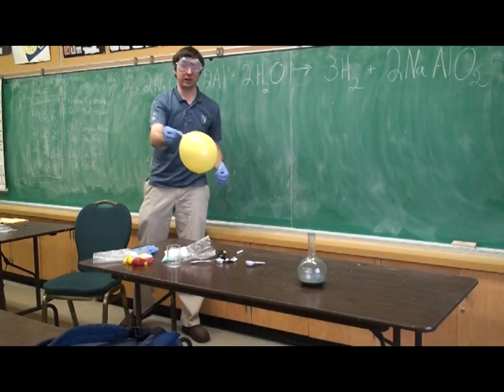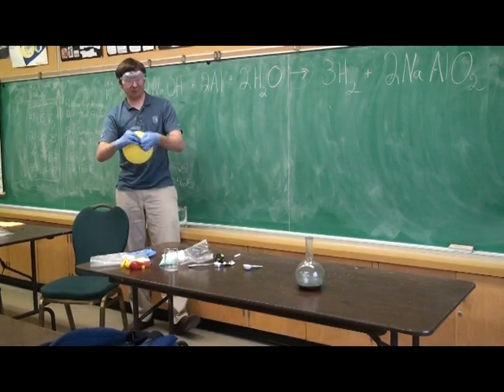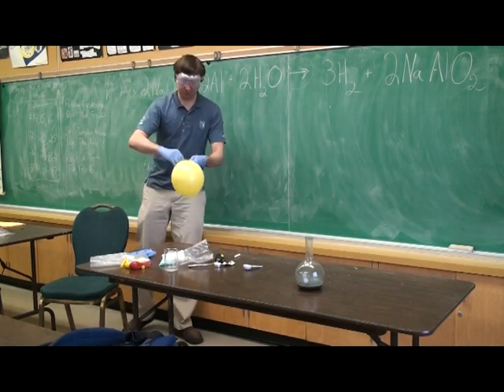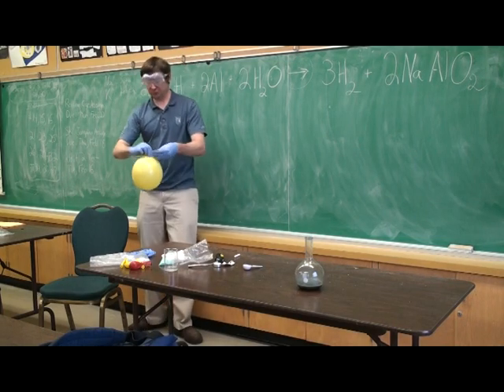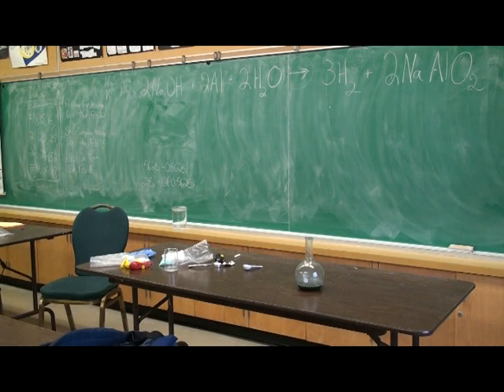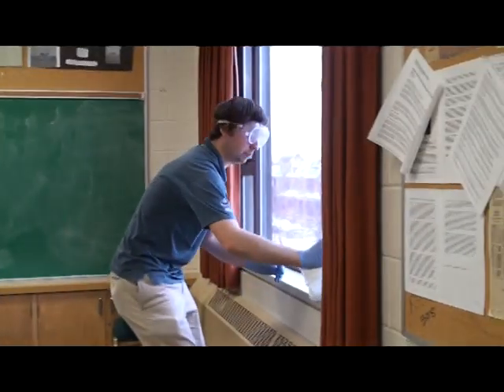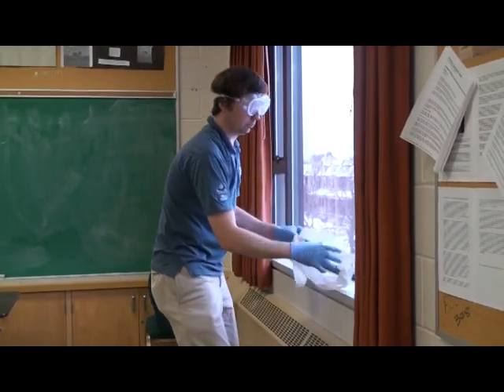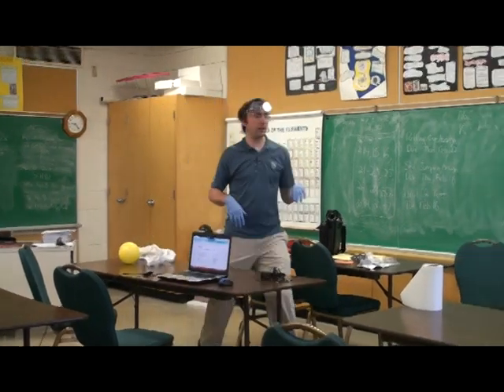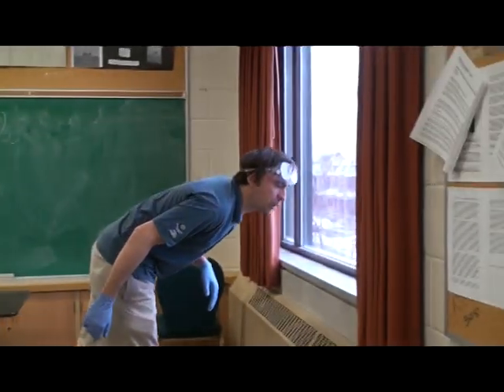So this balloon is actually very hot right now. This balloon is going to go over here. Notice how it's getting smaller — I'm going to put it out the window. And notice that all the aluminum is gone. It just... yeah, the aluminum actually disappeared.